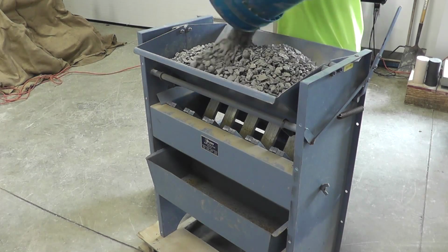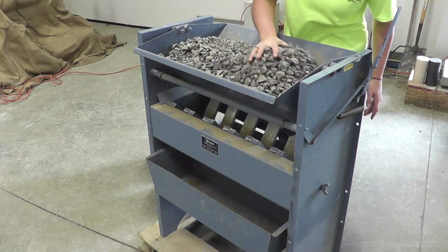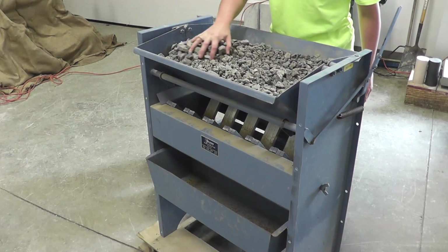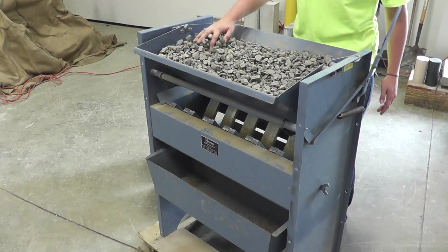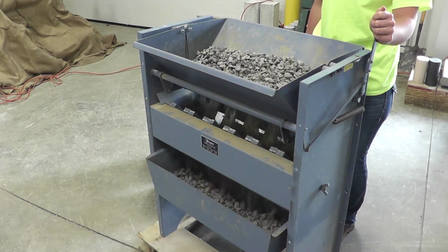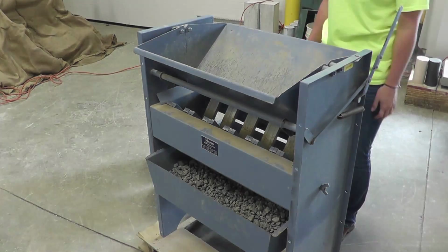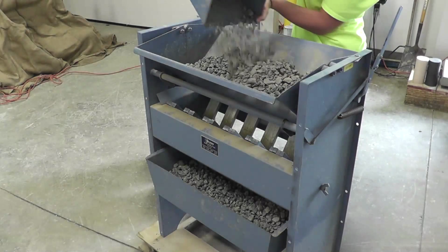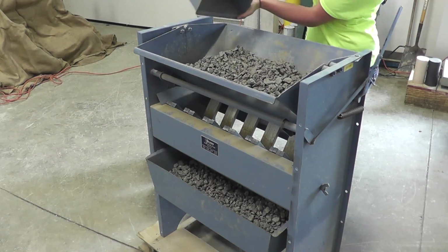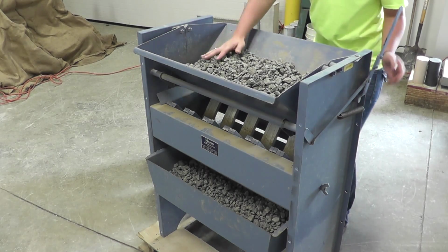Place the original sample, or portion thereof, in the hopper or pan and uniformly distribute it from edge to edge, being sure the sample appears homogeneous or well blended. Carefully introduce the sample into the chutes in a manner to allow the aggregate to flow freely through the openings and into the catch pans. Continue this procedure until the entire sample has been halved, being careful that catch pans do not overflow.